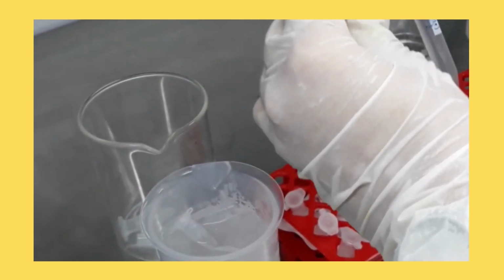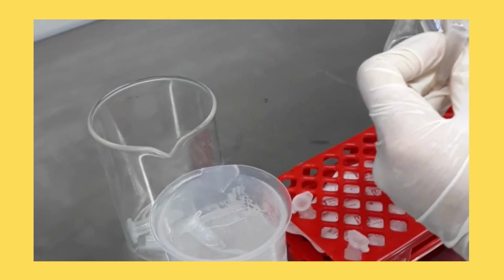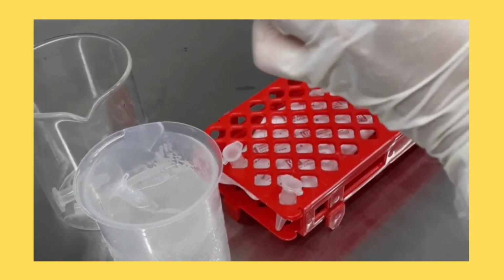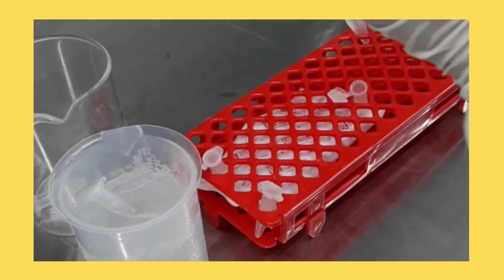After centrifugation, transfer the transparent upper aqueous phase to a new centrifuge tube using a 200 microliter pipette. Usually, up to 700 microliters of the colorless phase can be transferred to the tube.